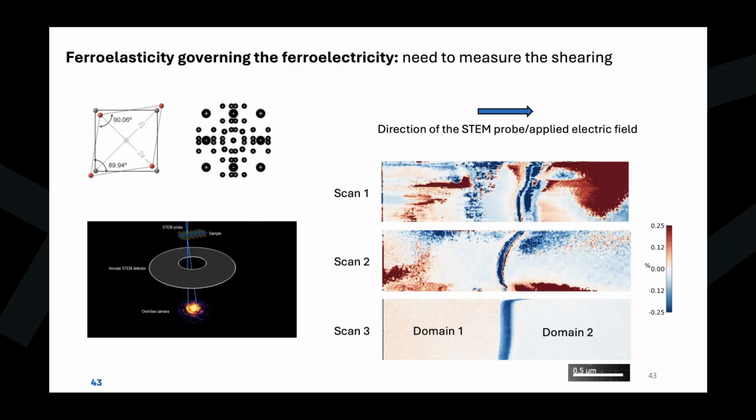So we wanted to understand what was happening. And this was the start of our wonderful collaboration at NSEM several years ago now, where we started looking at 4D STEM and using this to also map out the change in the strain tensors. For us, we were looking at the EXY, and seeing how that changes.